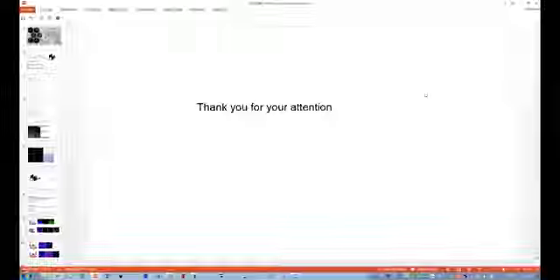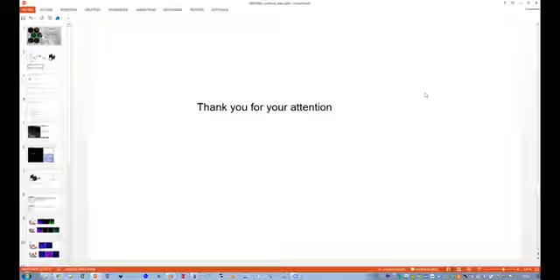Thank you, Juliette. That was really great. That was a nice one. I don't know, it might be Chinese for people who have never used confocal, but that was super clear. And personally, I'm happy with it. So are there any questions, comments?